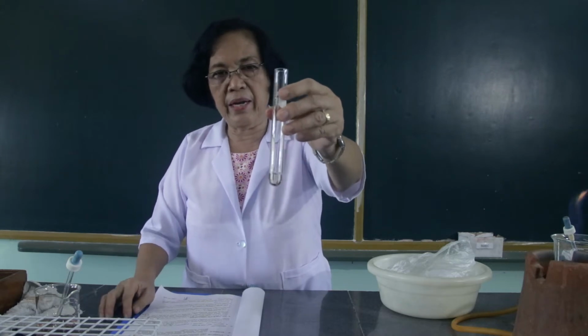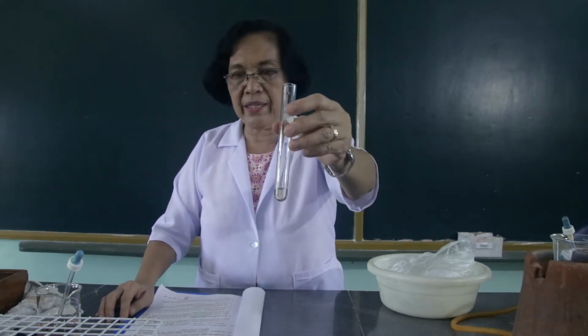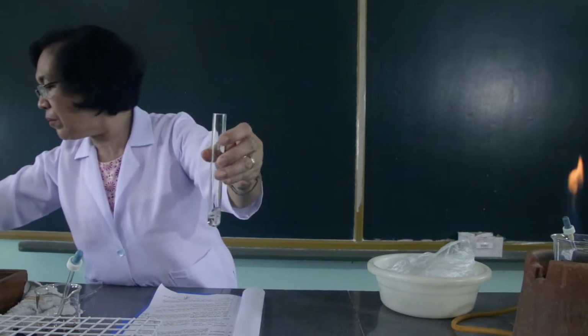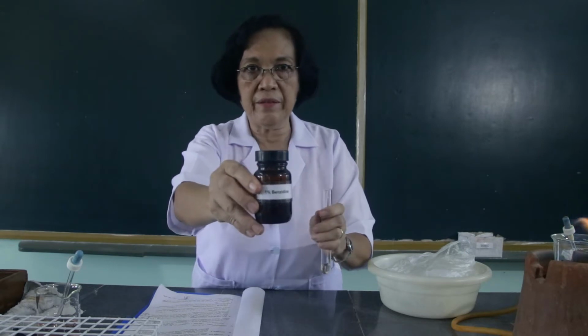Then we are going to add 6 ml of the benzidine solution to this 2 ml of the diluted blood. This is the benzidine.